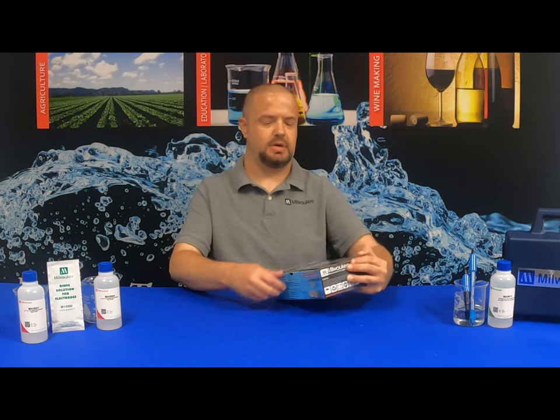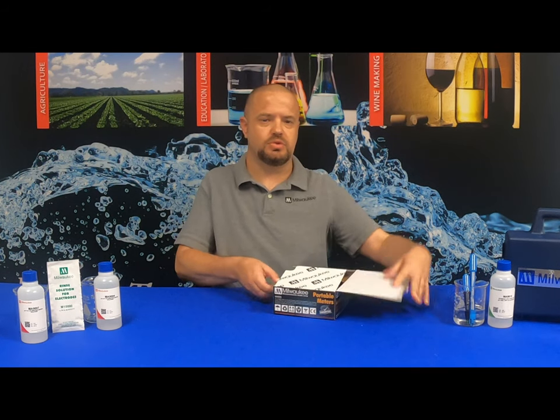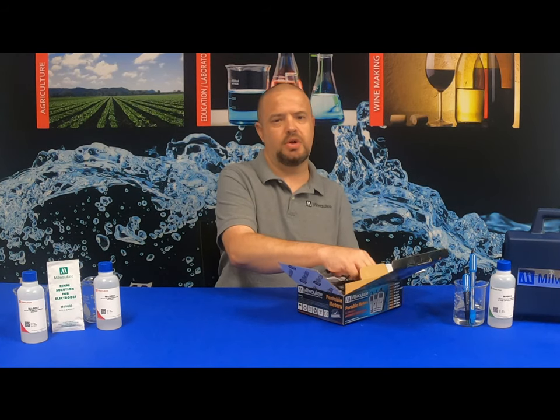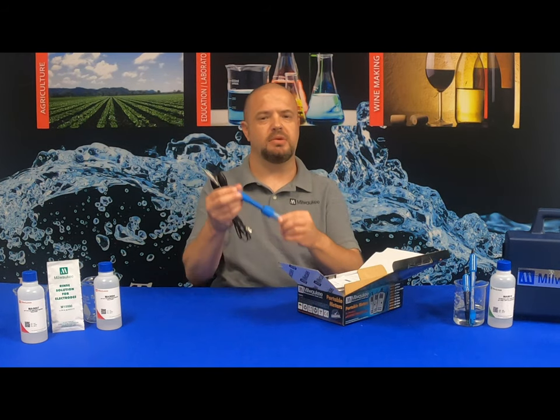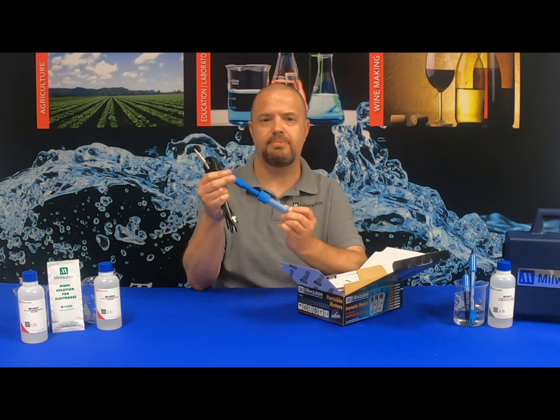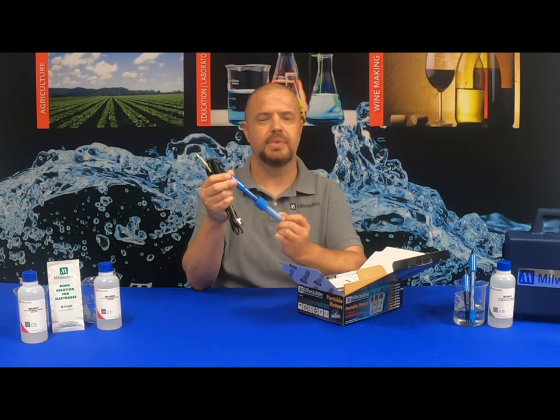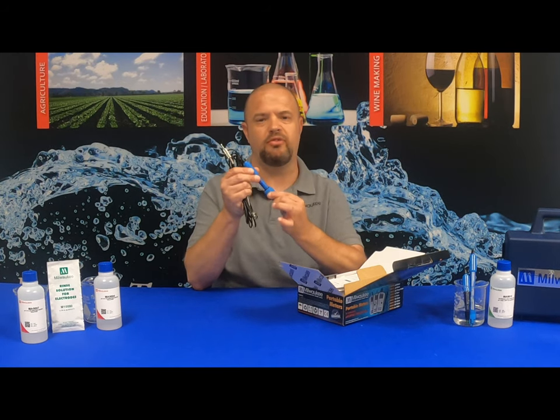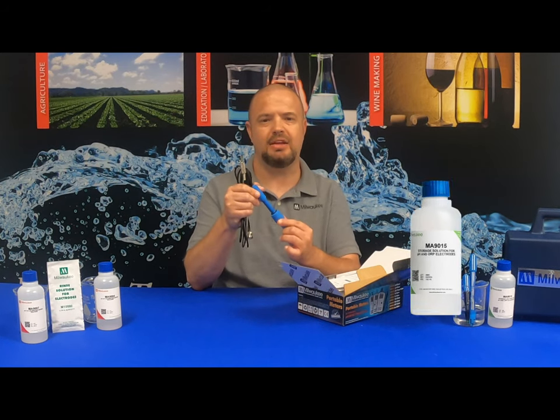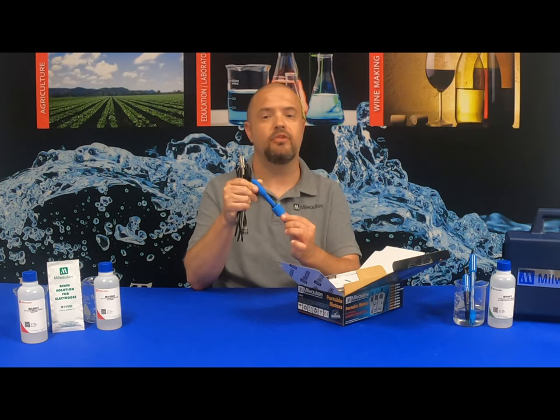Once you've received your Milwaukee Instruments MW102 pH meter, the first thing you want to do is remove the pH probe from the box. You may notice some crystallization between the pH probe and the soaker bottle itself — there is nothing wrong with the probe, it is not defective. Simply remove the soaker bottle from the probe, wipe the probe off, then place it in Milwaukee Instruments MA915 storage solution for a minimum of two hours prior to calibration.